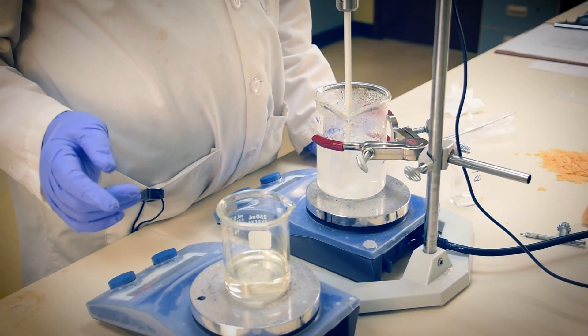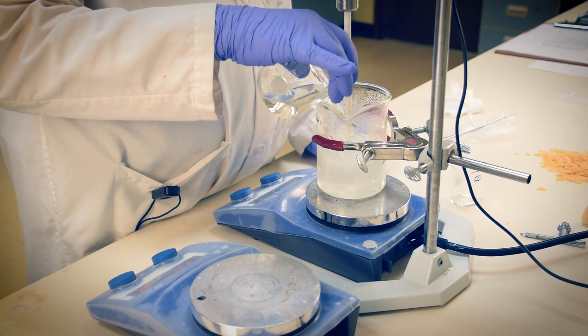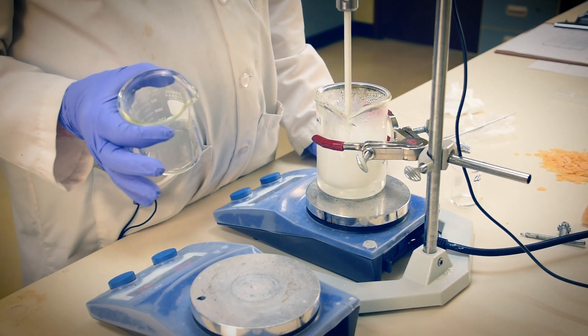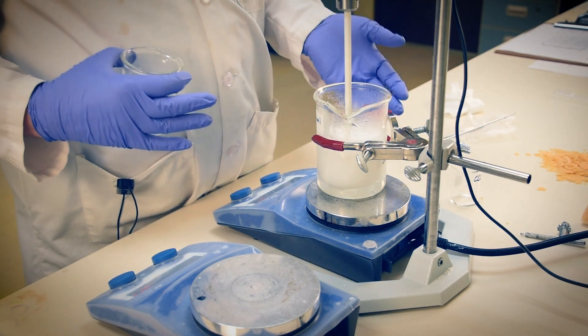Both of our phases are ready at 75 to 80 degrees Celsius, so we'll now combine them. At this point, we have a very stable emulsion, nicely stabilized with hydrated Rabigel EZ1. We'll let this mixture slowly cool with moderate agitation.